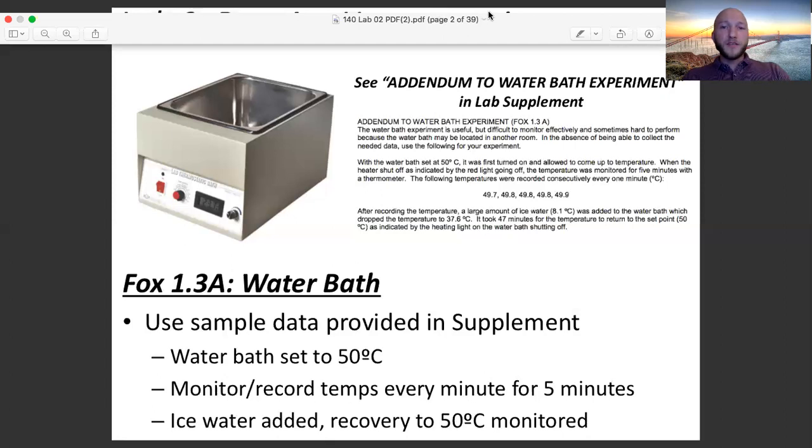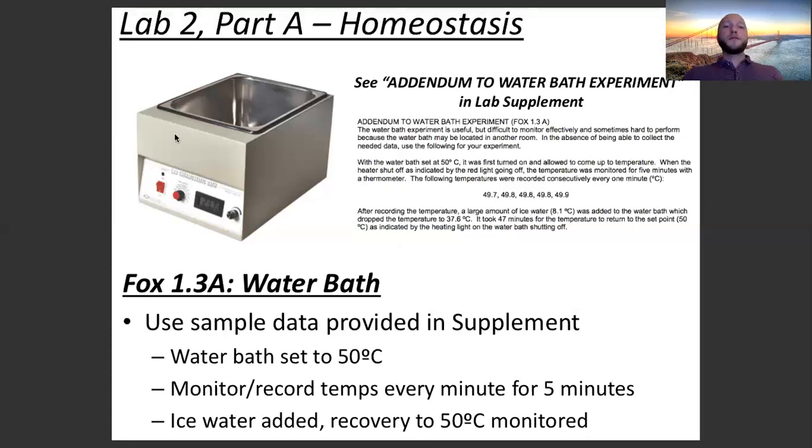All right, a water bath looks like this object on the left side of the screen. It's a container for water. And on this dial in front of that container, you say, container, I want you to keep this water at this temperature. I want you to keep this water at 50 degrees Celsius. So that's what we're doing in this experiment. We're putting water inside the water bath and we're saying, hey, water bath, keep this water at 50 degrees Celsius.